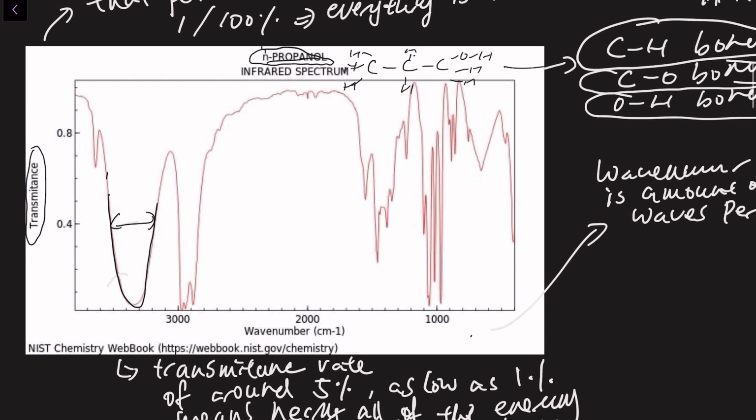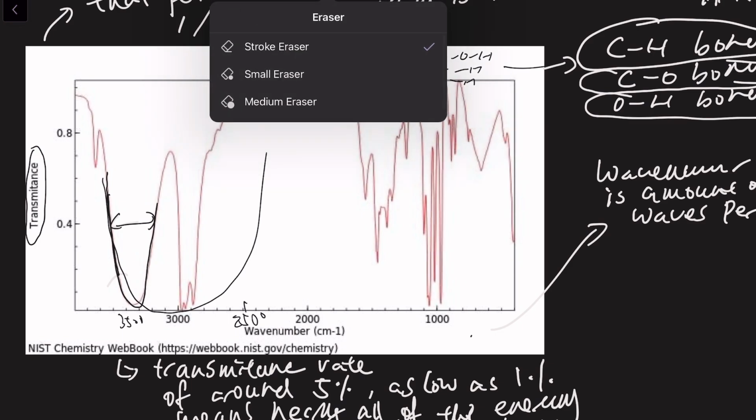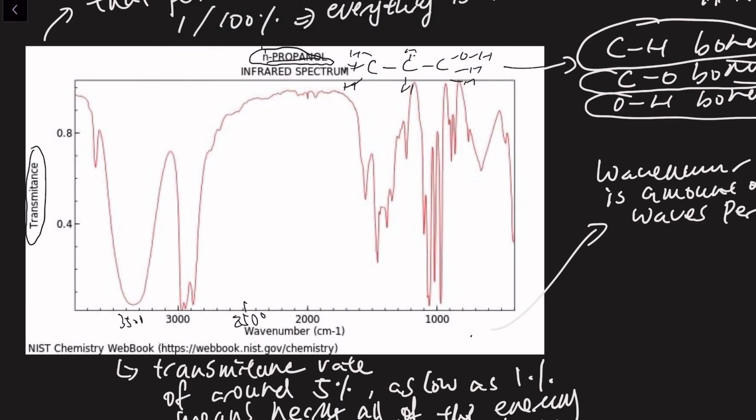For the acid spectrum, you know it goes from 2500 to around 3500. So it will look something like this, which is really broad, very big. So from this discussion, we can know that this is due to the OH bond in alcohol.